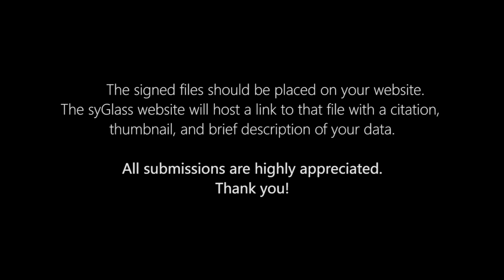The signed file should be placed on your website. The syGlass website will host a link to that file with a citation, thumbnail, and brief description of your data. All submissions are highly appreciated.